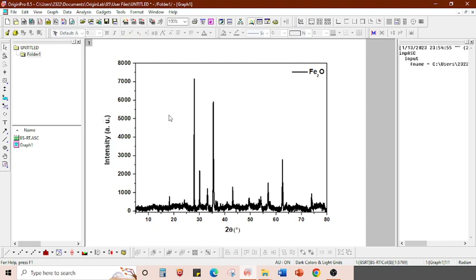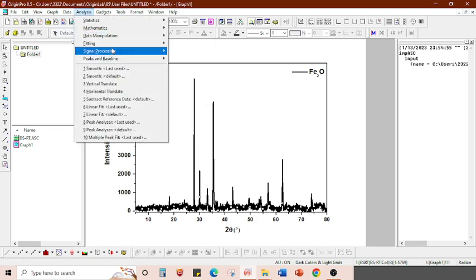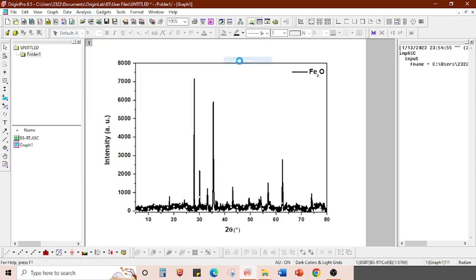Yes. Now I'll go into how to remove all this noise, or how to smoothen it. When you have to select this graph, you just click here and you should be able to find dots, which are called data points in the graph you have selected. Then you go to Analysis, Signal Processing, Smooth. Then do not click this last used option, so that it opens the dialog box.